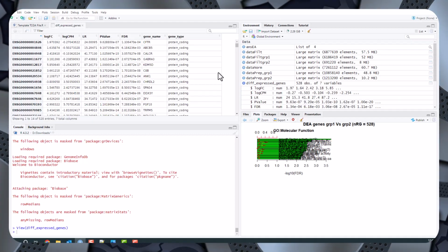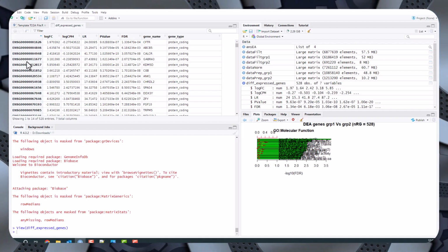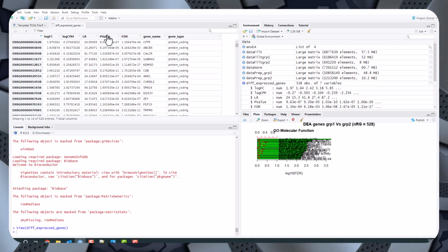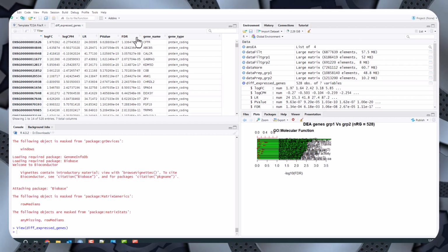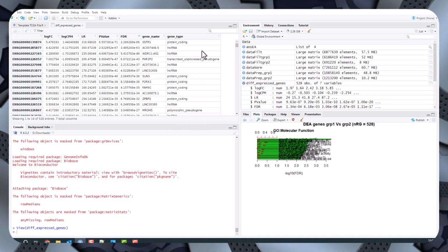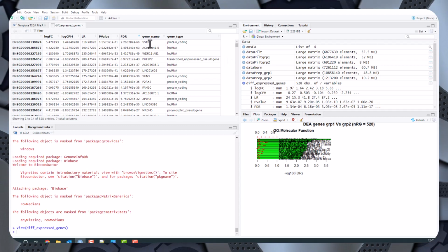So if I look at the differentially expressed genes, you can see here's the Ensembl gene name, the log fold change, the likelihood ratio, the p-values, the false discovery rate. Best to order them by false discovery rate. That changes the order, so the actual top gene is SSTR1.